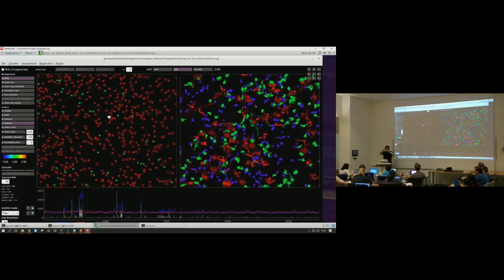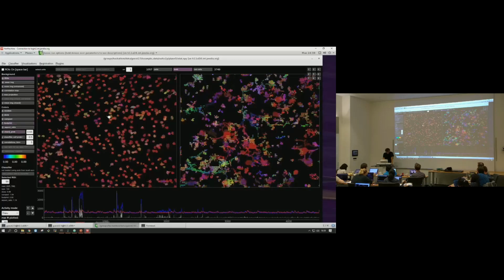So the footprint is just kind of how many pixels around our ROIs are correlated with it, whether they're in the ROI or not. How big of an area does this ROI correlate with? If it's a really big area, that's probably not good because it's probably like a neuropil. If it's a really small area, then it's probably a process like a dendrite or something. And then, okay, channel 2 probability.